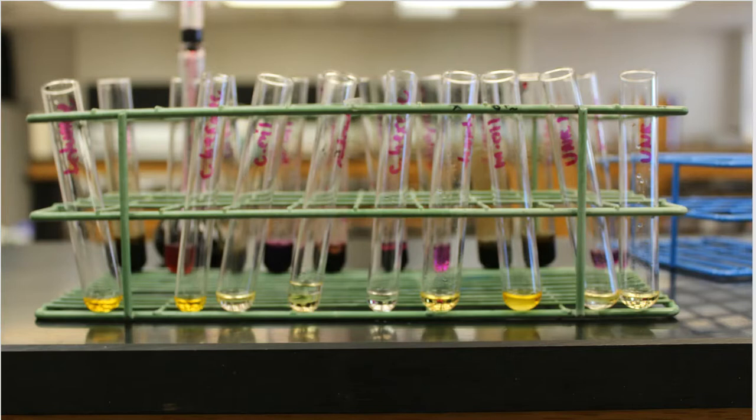Keep in mind, not everything that has a double bond will actually make this color disappear, and one of those we did talk about was something like an aromatic. So if we had an aromatic on our hands, don't be surprised if this doesn't turn the color colorless. It will keep the yellow color because that aromatic ring is not going to be disrupted, and it's not going to change and break apart that bromine.